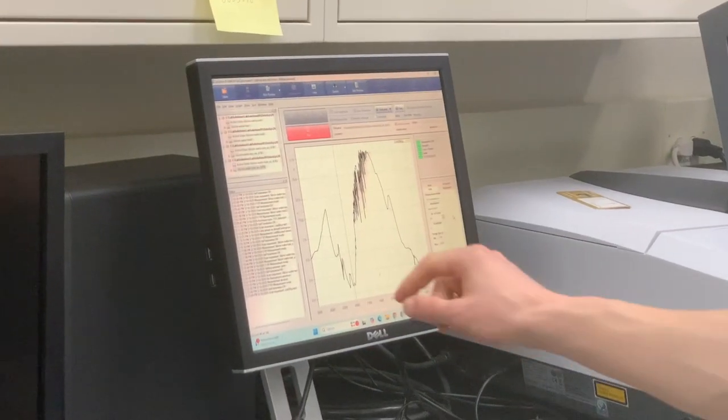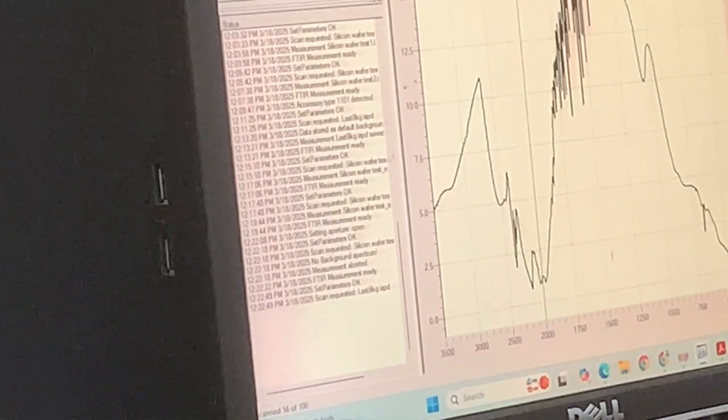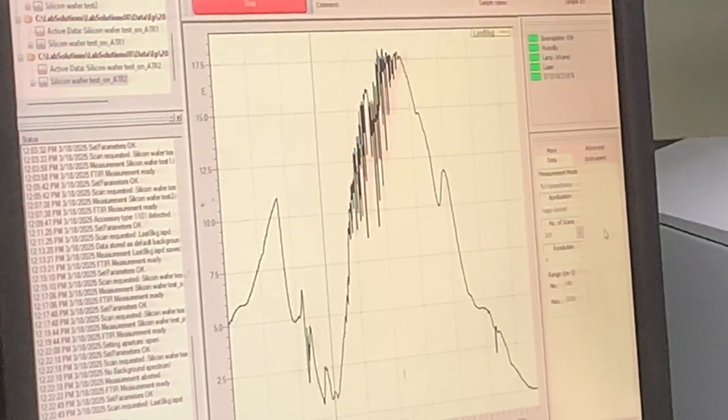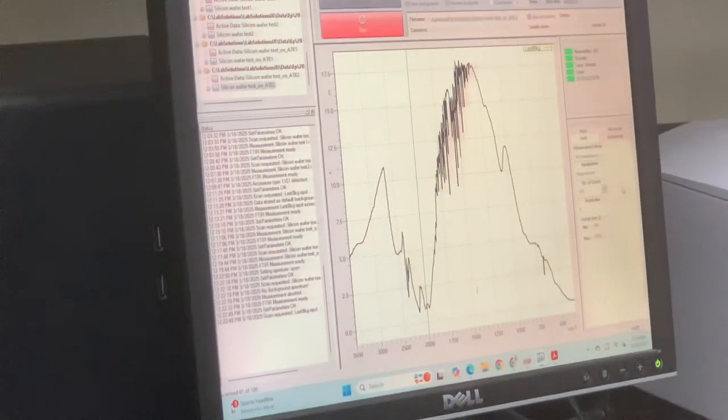It's the other way around. What this is showing here is that bond, let's call it a CC bond, carbon-carbon bond. If the energy of the wavelength matches the wavelength of the stretch, then the stretch will absorb it, but only if it matches. If it doesn't match, this would be gone, and it would just look like this. So that's why it seems strange when you look at it. But if the line is flat and it's not doing a dip, it's not matching any of the bonding.